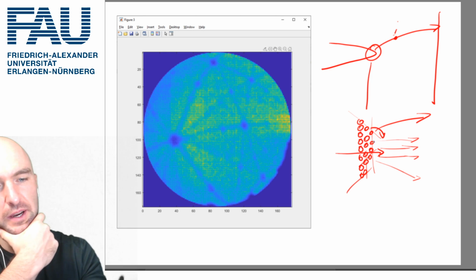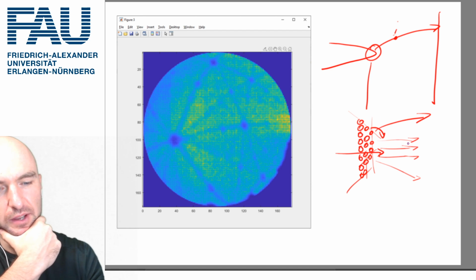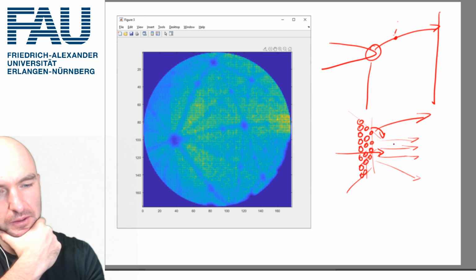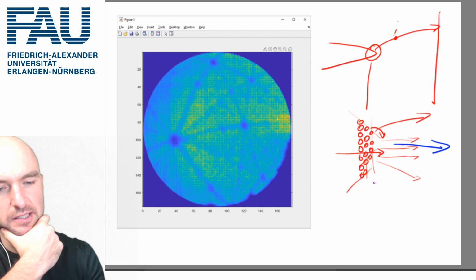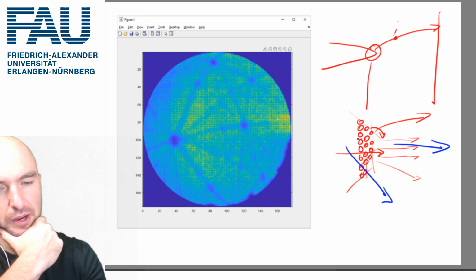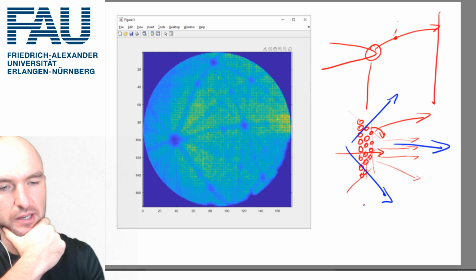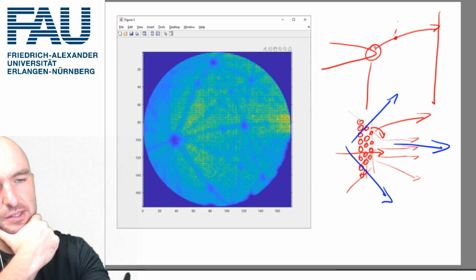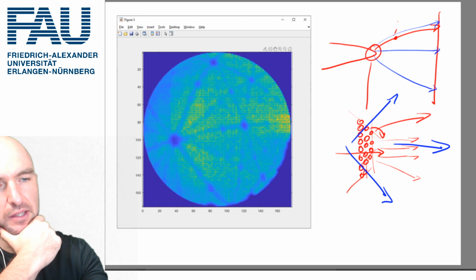And so if we look at that locally, we might say, okay, in this direction here, this is a low index crystallographic direction. Then this here is a low index crystallographic direction, and this here is a low index crystallographic direction. And those directions will then look a little bit different on a detector.